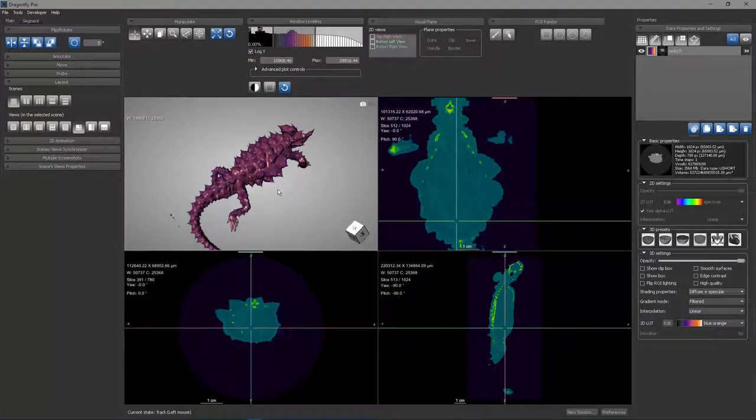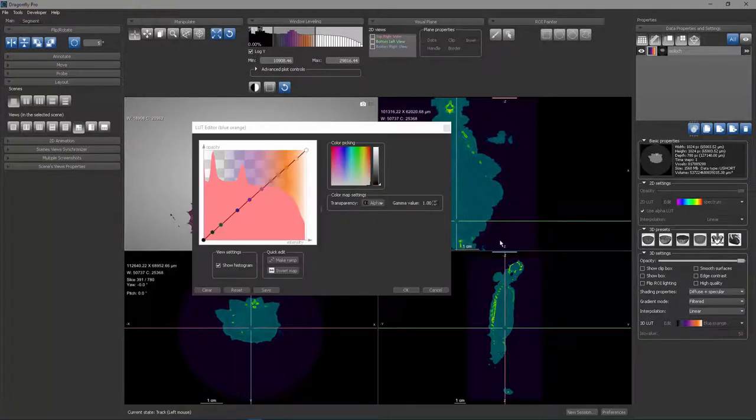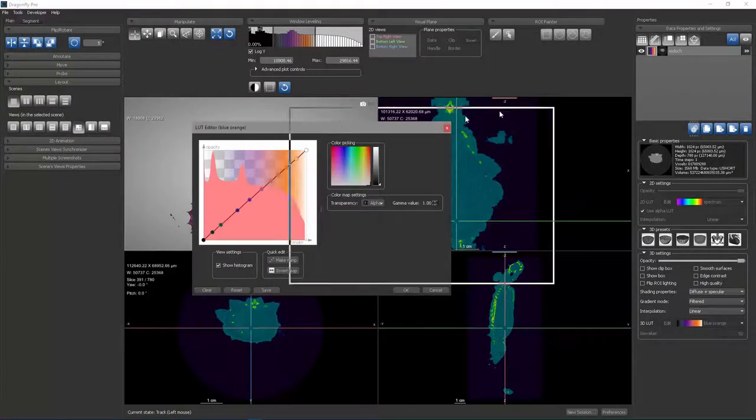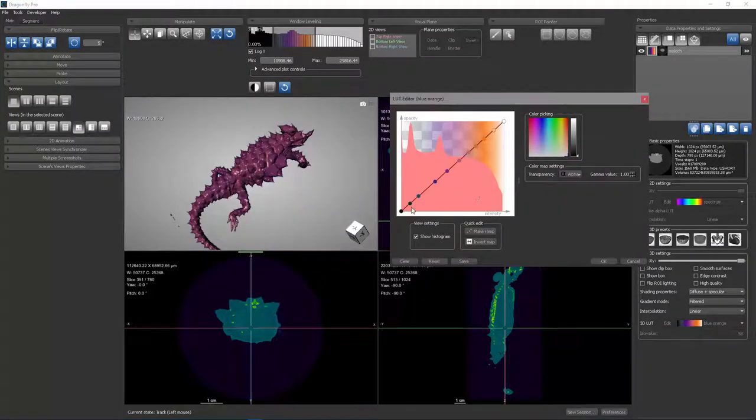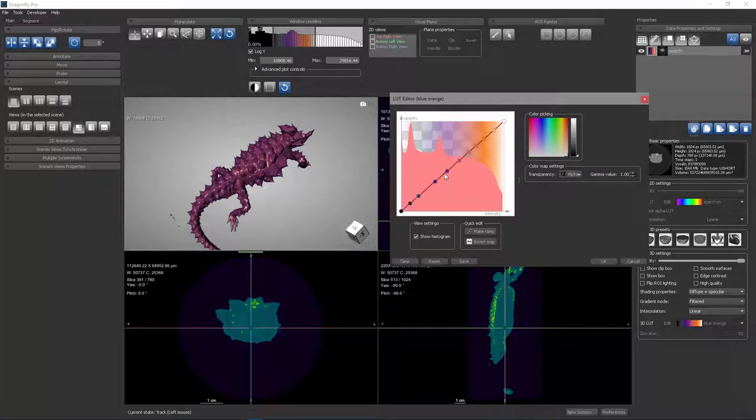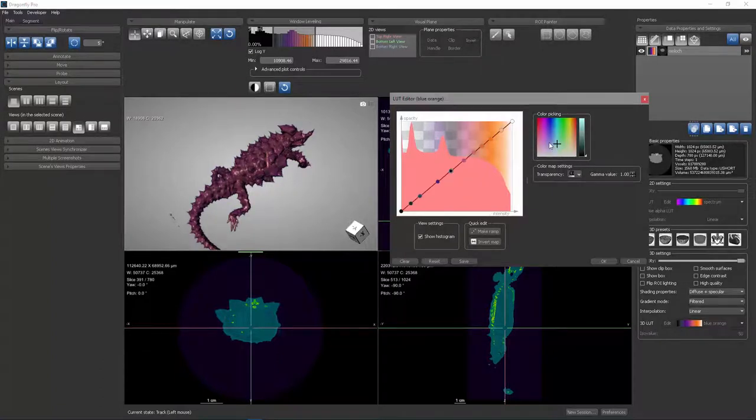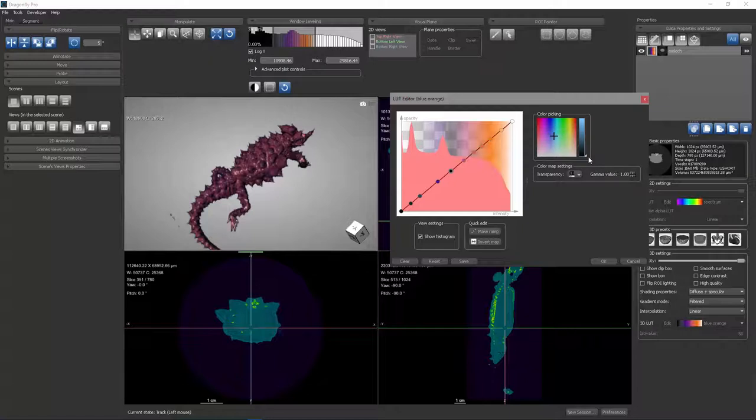Let's return to the 3D window, and let's return to the LUT editor. I showed you that we have a lookup table that's composed of all of these different colors. You can edit this. You can change the lookup table by changing these nodes in the lookup table. You can click on a node, and you can change its color by using the color picker over here.